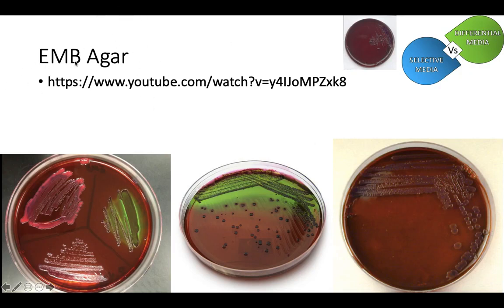Eosin and methylene blue, both of those dyes do really well together to kill most gram-positive species. But most gram-negatives can survive in the presence of those two dyes. Most gram-positives can't. So that's what our selective agent here is, the presence or absence of those dyes. Can you survive in the presence of them or not?